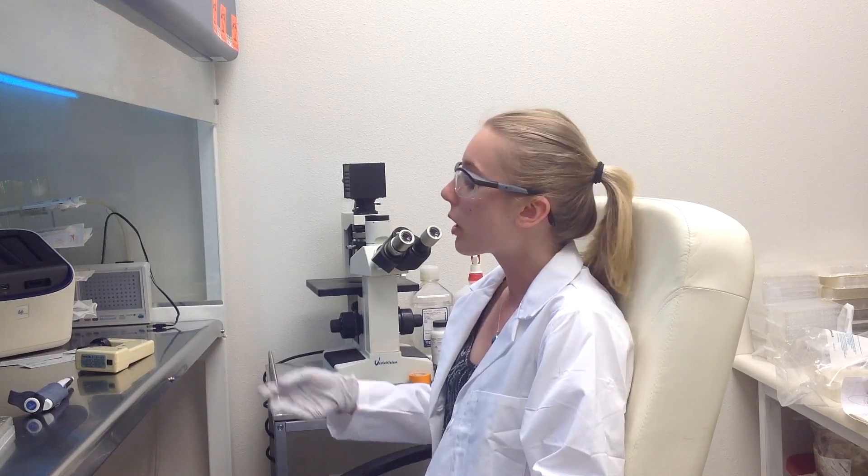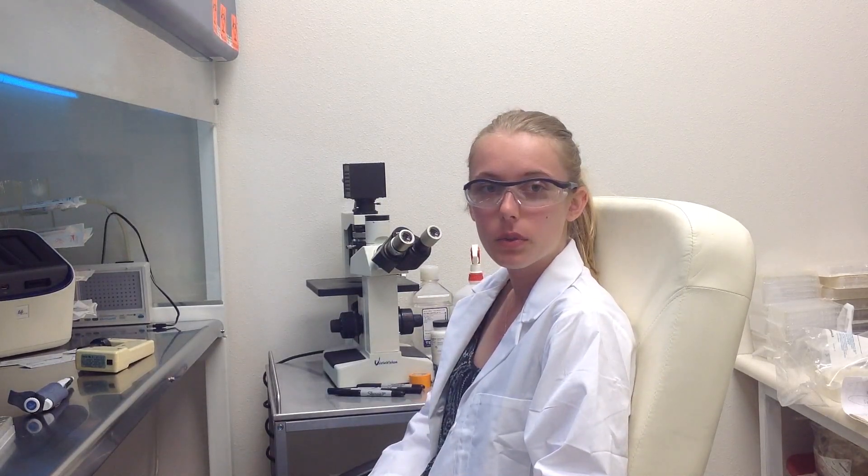Today we will be transfecting HMEC cells obtained from ATCC. We will be using a transfection kit manufactured by Altogen Biosystems.